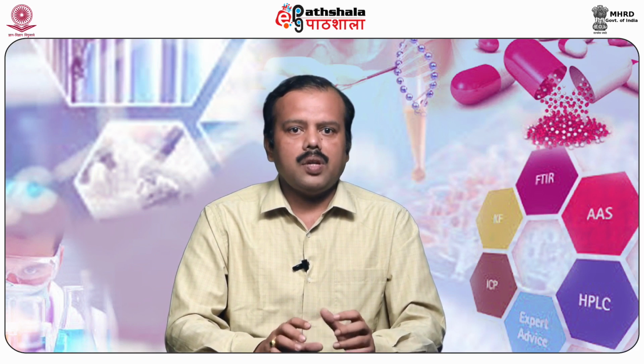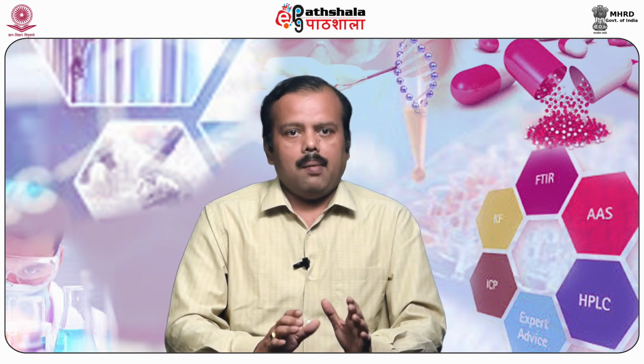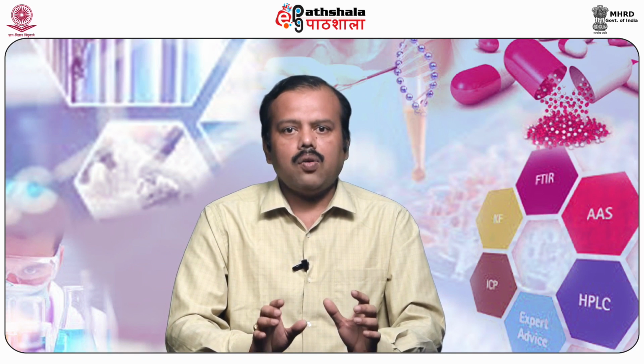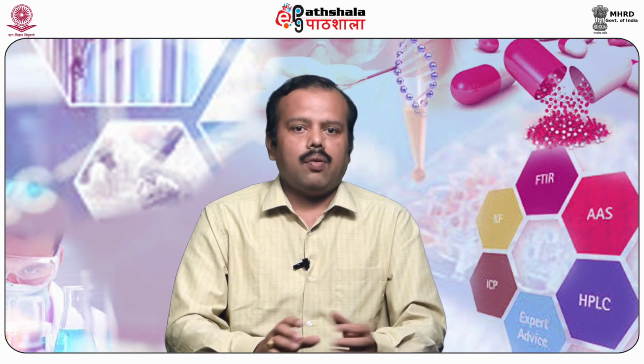and post-experimental work. Fiducial limit. The fiducial limit of error of the estimated potency should be not less than 95% and not more than 105% of estimated potency. The microbiological assay has been used extensively to estimate the potency of growth inhibiting substances by comparing their quantitative effect with a reference standard of defined potency to establish pharmaceutical equivalence of new generics, new molecules, and as manufacturer quality control.